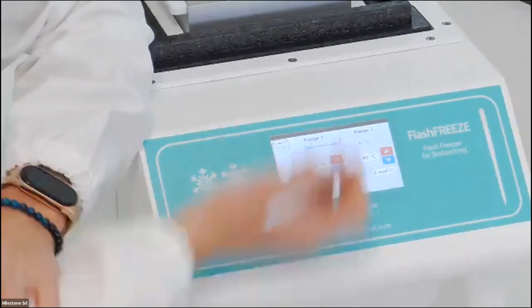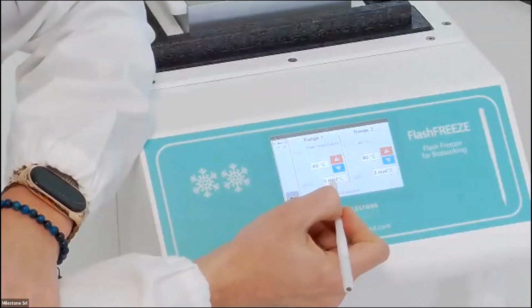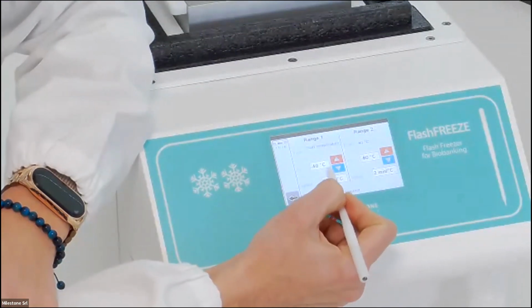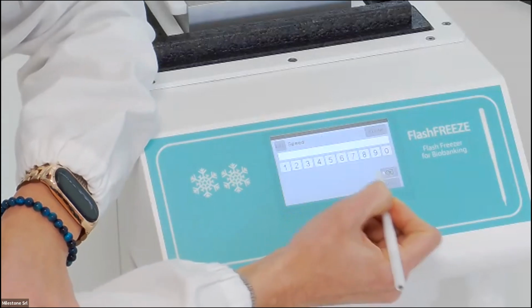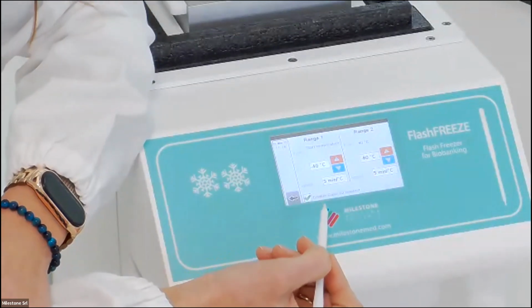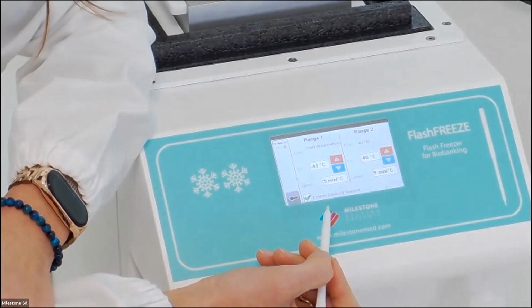So for example, if you have a stem cell, just as a hypothesis, maybe it's better to freeze them in a very slow way. So you can set up a minimum speed in the first range and the minimum speed also in the second range. In this way, the freezing is really slow, and maybe it preserves cell viability better.